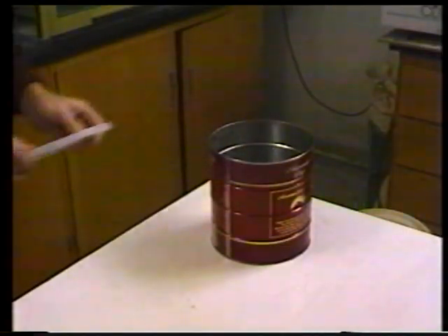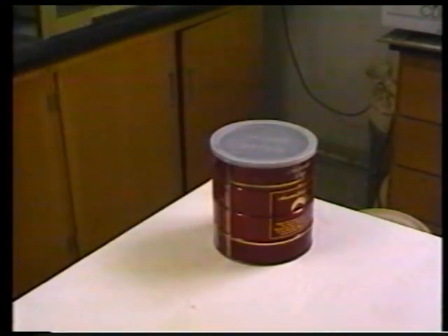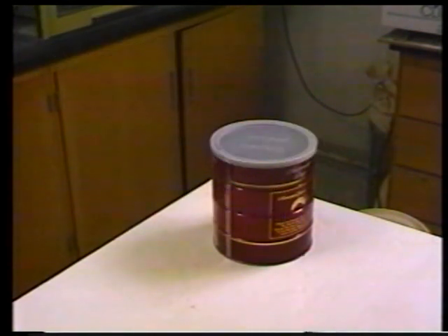Once you've covered the sample with the kerosene, place the intact coffee can lid over the coffee can. This serves a dual purpose: first, it prevents potentially hazardous and flammable fumes from escaping into the room; the other purpose is that it saves on the kerosene by preventing evaporation.